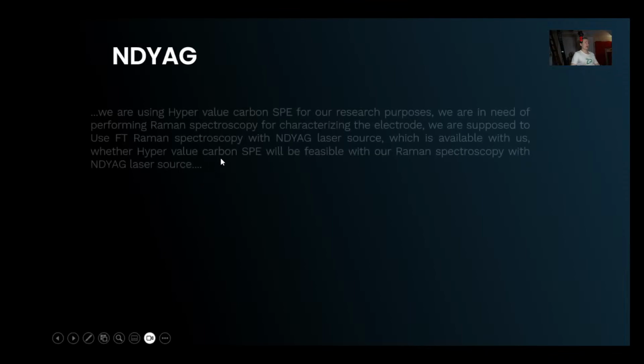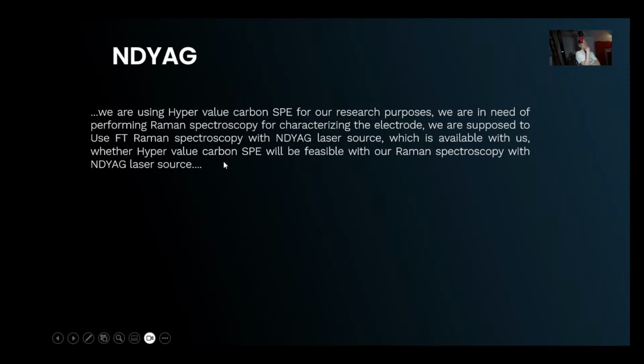Anyway, to their questions. They've got this neodymium, yttrium, aluminium garnet laser. I must admit, I use lasers, but I'm no great expert on them. That said, I will answer their question. They've got this hypervalue carbon screen printed electrode, which I'm pleased about. They want to characterize it with Raman spectroscopy. It's Fourier transform Raman spectroscopy, and they want to use this neodymium, yttrium, aluminium garnet laser source to essentially light up the sample.